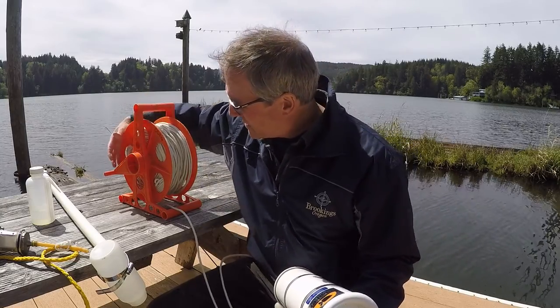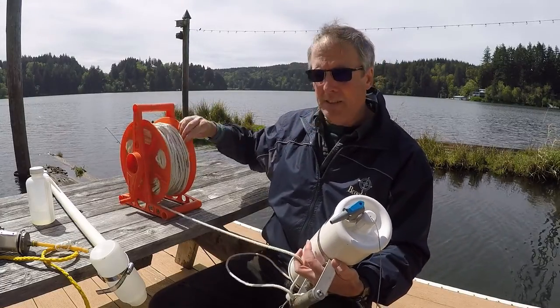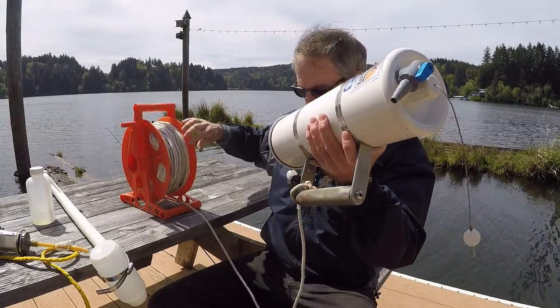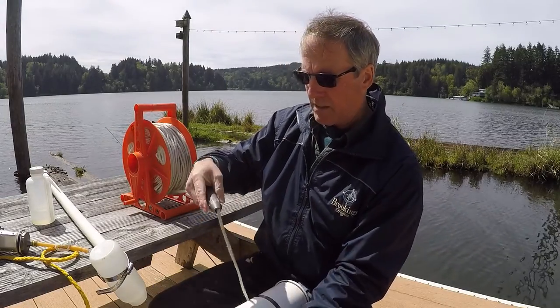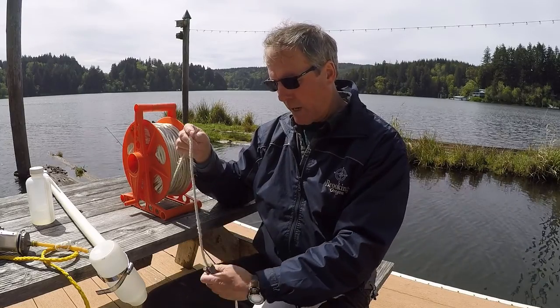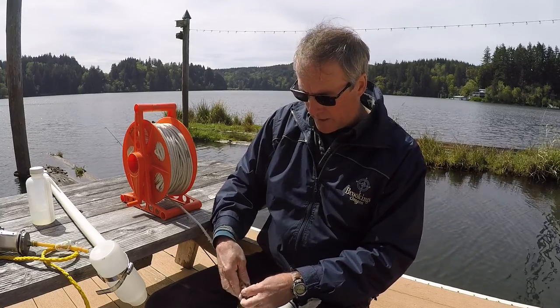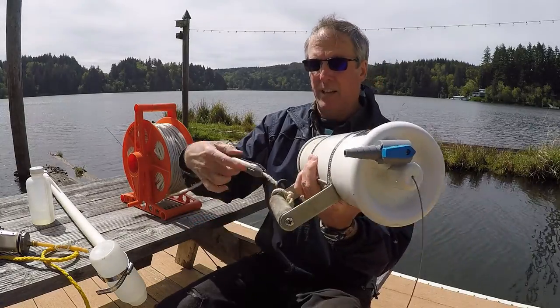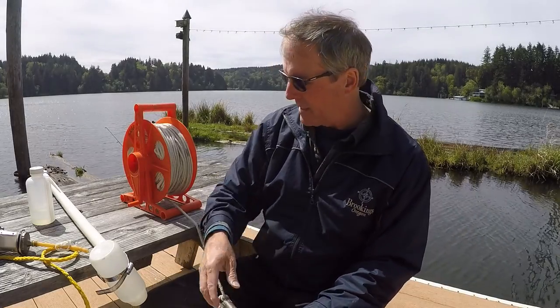And then this reel allows you to reel the cord back in without a lot of hassle, especially when you're in a boat. It's kind of dangerous to have your cord laying all over the place. You can trip on it. And another little trick that we use sometimes, to keep this weight from running all over the place when you're not using it, is you can put a little loop in the line. Just a little knot, and that keeps your messenger from sliding around or causing the line to be pulled out or something.